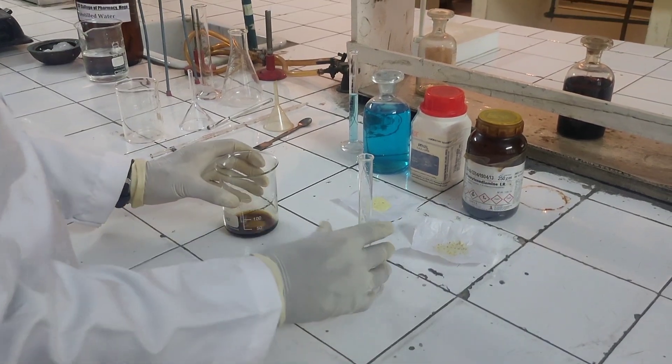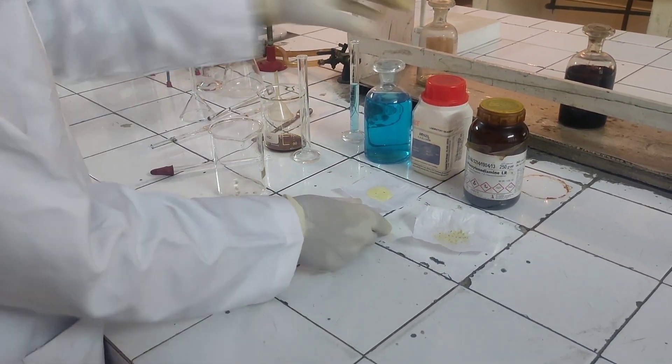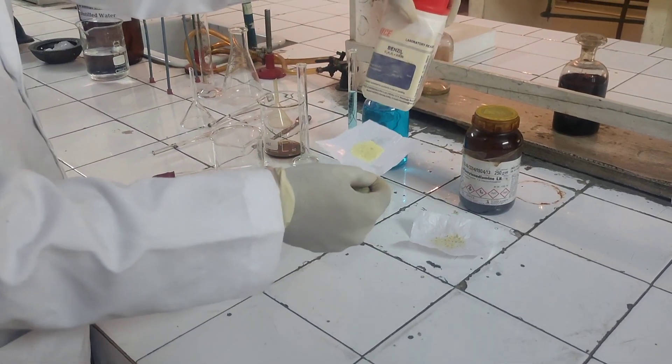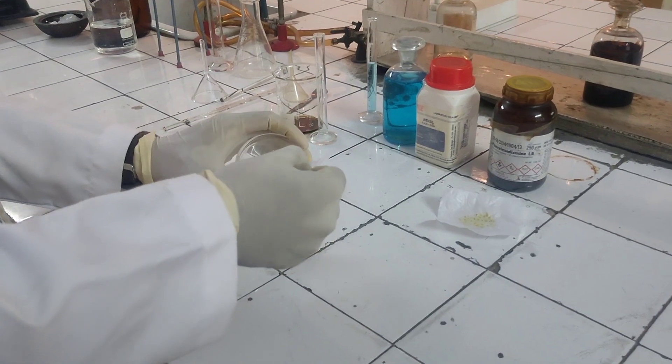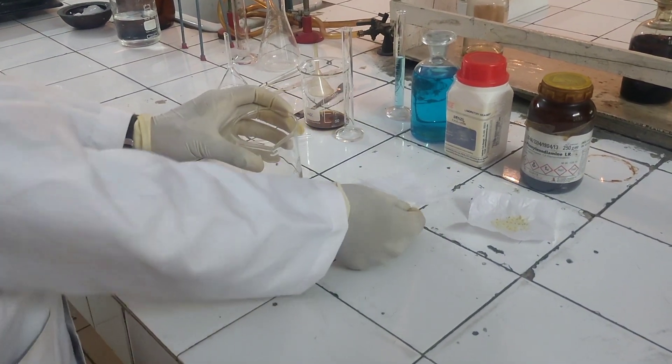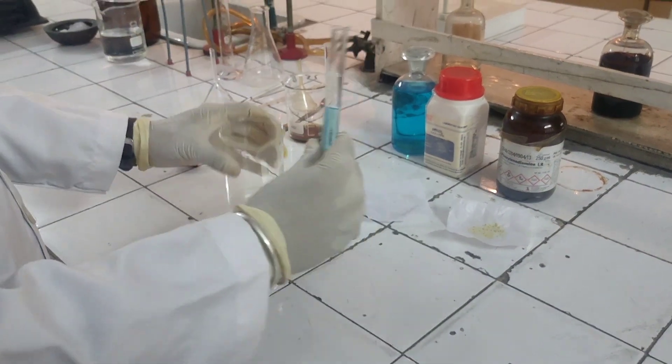Now the second step is take 2.2 gram of benzil and transfer it into the beaker. After that mix with 8 ml of rectified spirit.